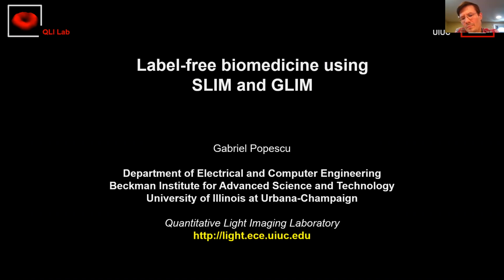One last thing I wanted to mention is also, we are able to analyze transport. So, you know, one of the methods to do microreology is to put some beads or some kind of small objects and measure their trajectories. From their mean square displacement, you can actually infer the viscosity and elasticity response of the medium. But in the cell, sometimes there is no discrete point that you can track. They're mostly looking like a cloud or like a cotton candy, if you like, as a continuum medium.